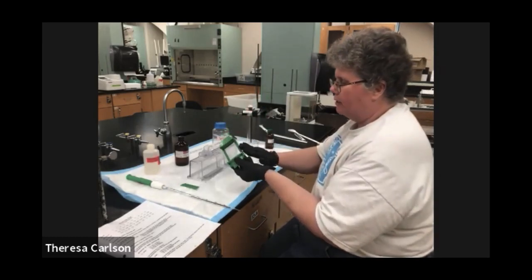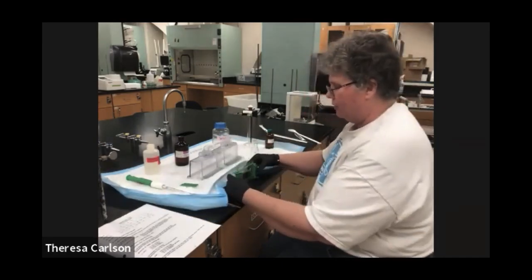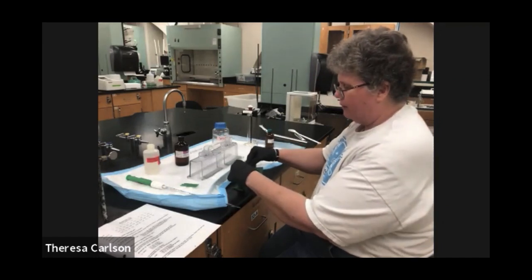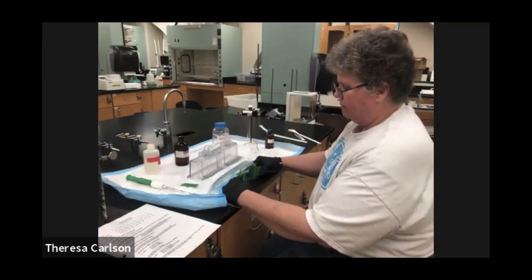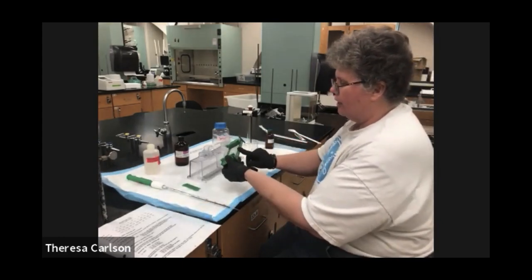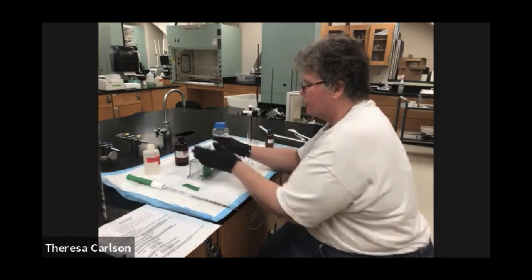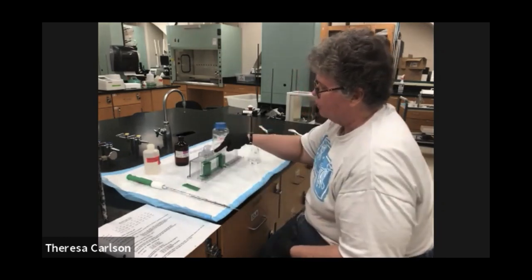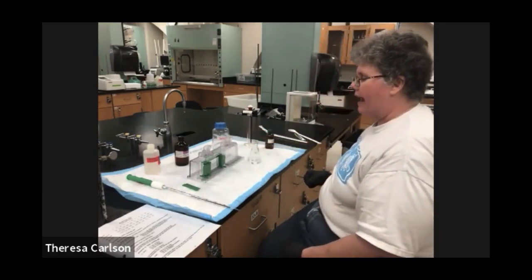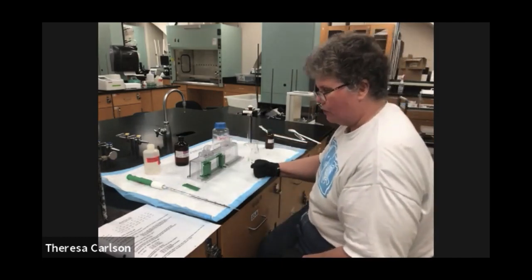You need these to be completely even for when they're pressing on these right here, so you have to move your bench cover forward a little bit, unlock it, and make sure the plates are down at the very bottom. Only then can you clamp, lock it open, and then you can take these plates and they get stuck right in here, just like that. This is a clamp pushing down on the plate, and that's pushing it down on this little gray gasket right there. So it's in the proper position, the shorter of the two plates towards you.